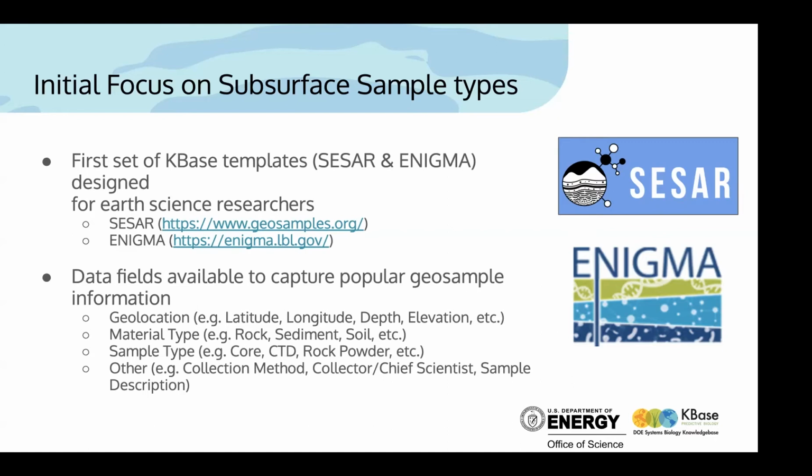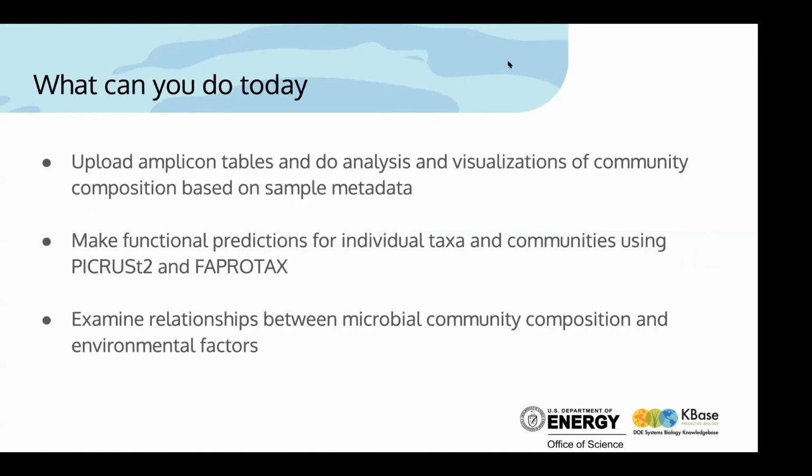So what I'm going to present, I'm just going to show you a little bit of what we can do, and walk through some of the output of apps from looking at amplicons and doing analysis and visualizations based on that sample metadata. I'll have one quick slide looking at the functional predictions of taxa, although you could do this at the community level as well. And with amplicons, the community is collected from the sample level data.